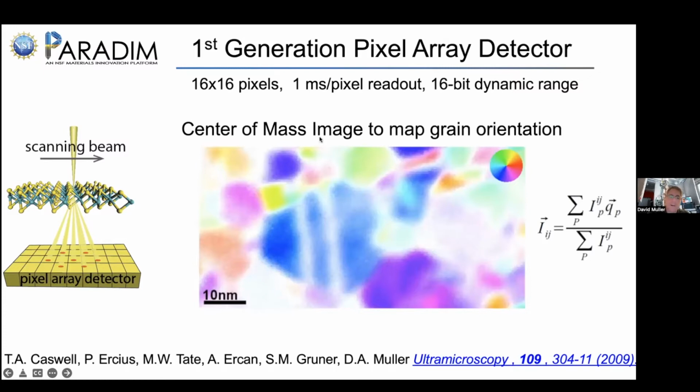And yeah, Chris, I can put up a picture of the difference between elastic and inelastic, but that's very much in the favor of the electrons. But even just raw particle number brightnesses, we're pretty high.